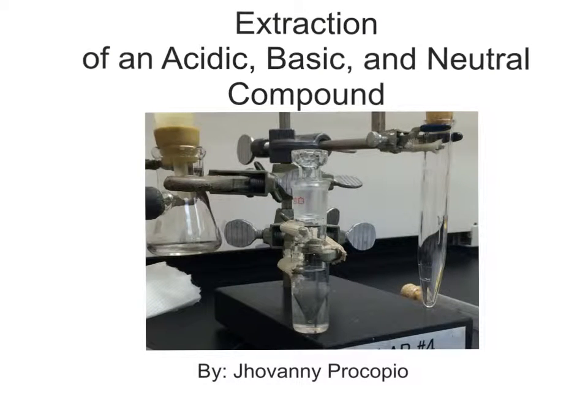This is a short video explaining the procedures to our extraction of an acidic, basic, and neutral compound for our organic chemistry class.